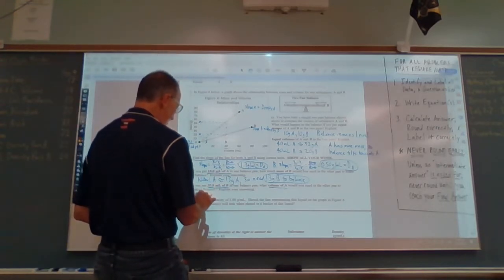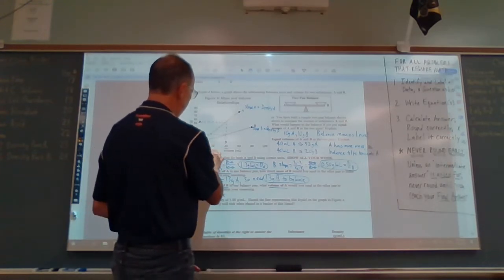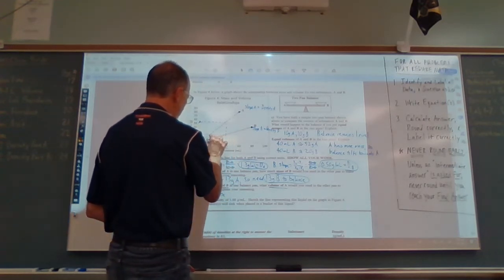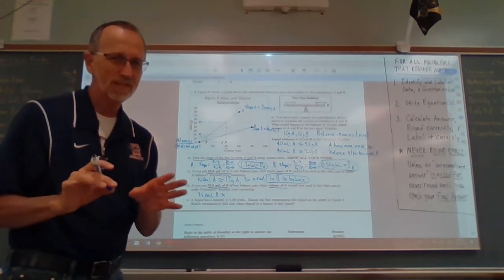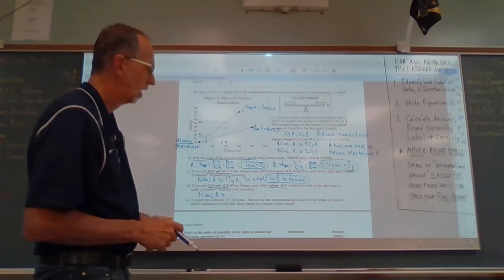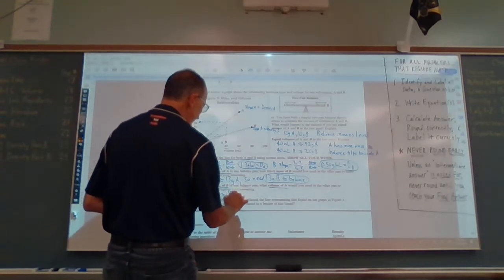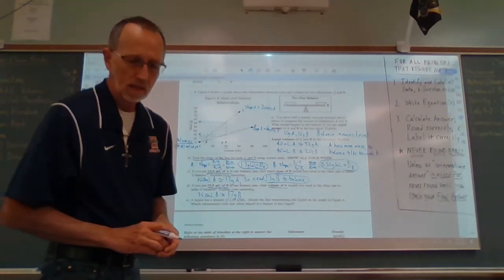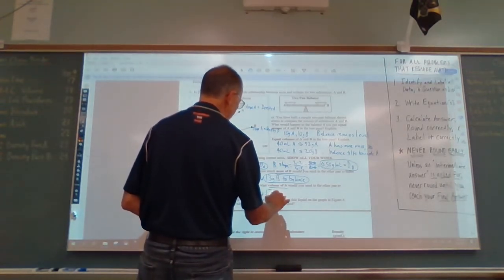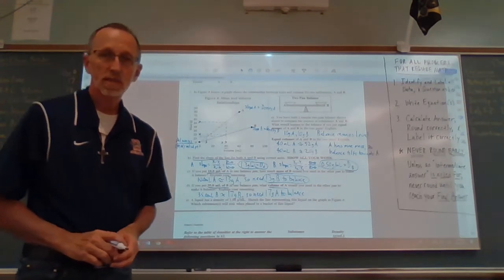So 35.0 mLs of B. What is that approximately equal to? Well, here's 30. Here's 35 right here. If I go up to the B line and come across, looks like it's a little more than 15, maybe 16 or 17 grams, somewhere in there. Again, I'm just trying to guess as best I can. I'm going to say 17 grams of B. So we're going to need 17 grams of A to balance. The masses have to be equal.